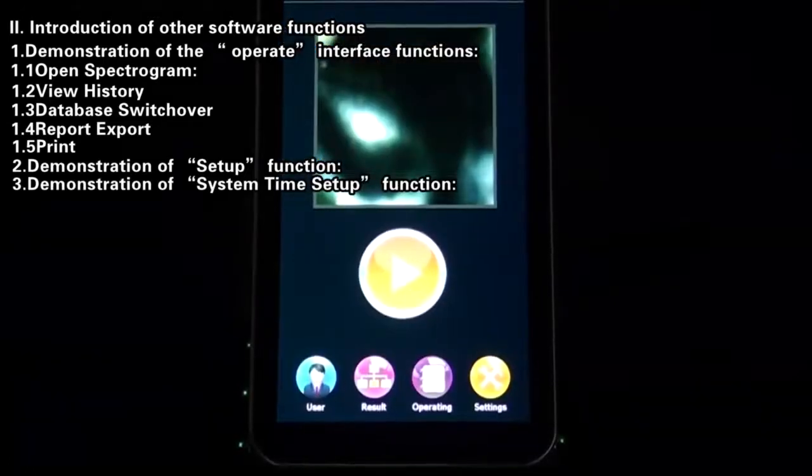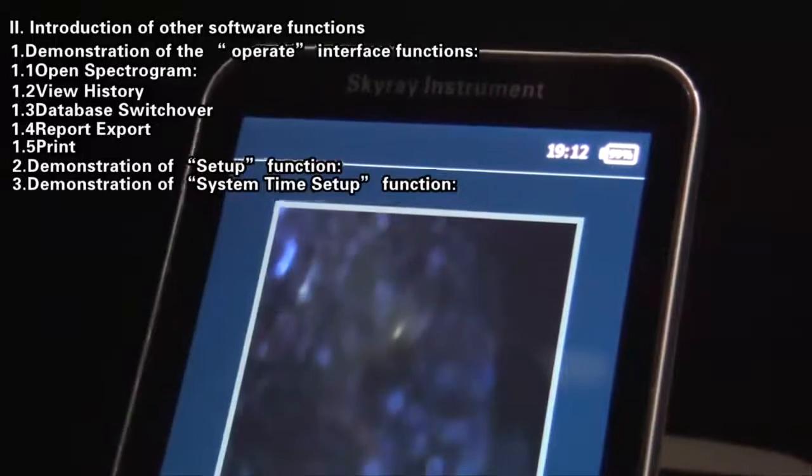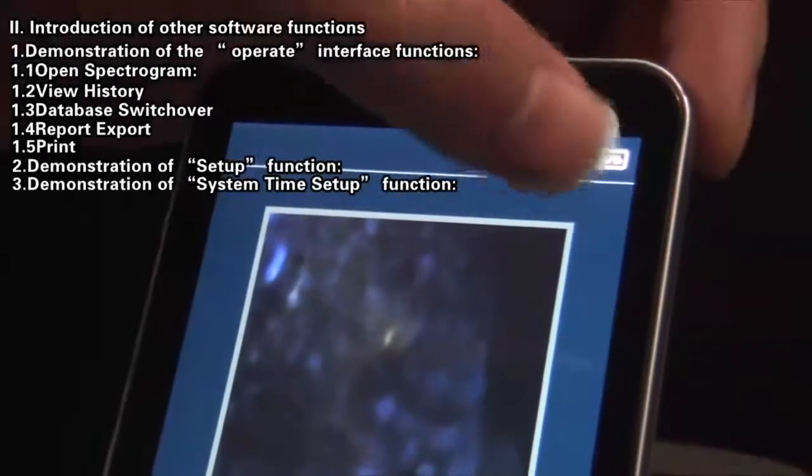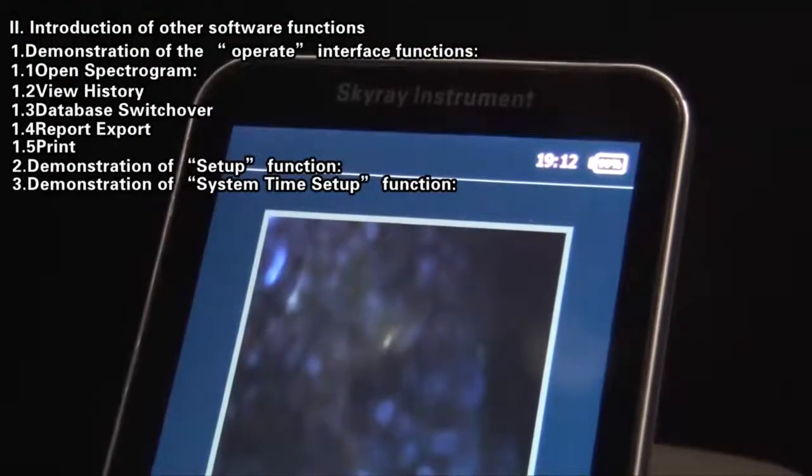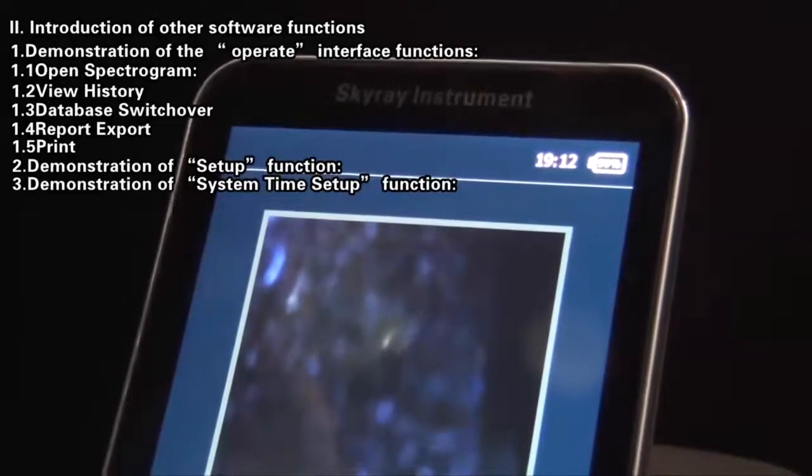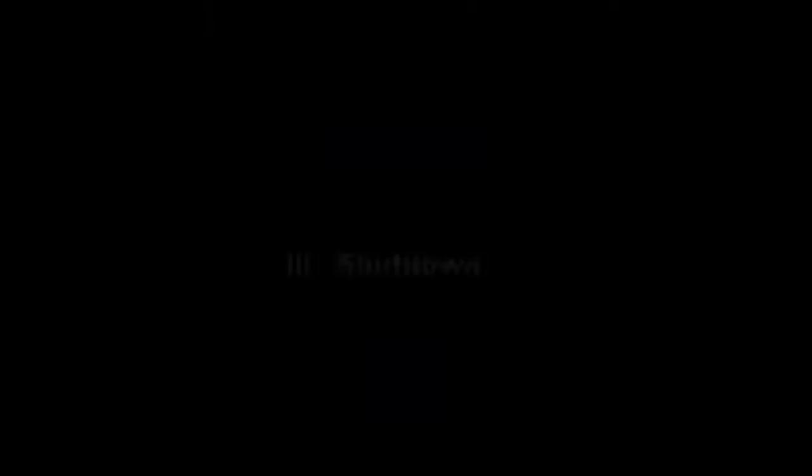Demonstration of System Time Setup Function: To set up the time of system on the main interface of software, double-click the time at the top right corner of this interface. At this moment, the time setup interface will pop up, then you can set up the system time according to current time zone.